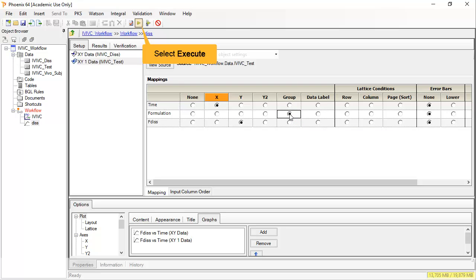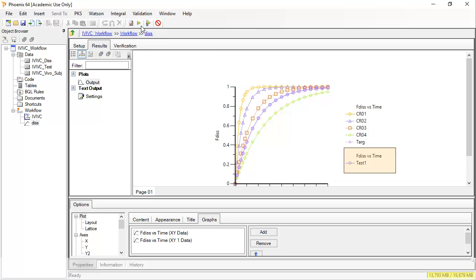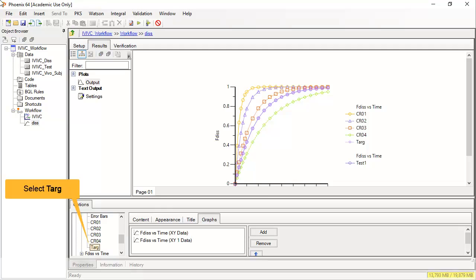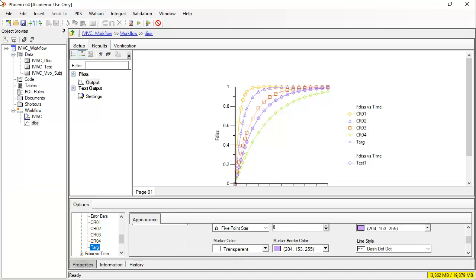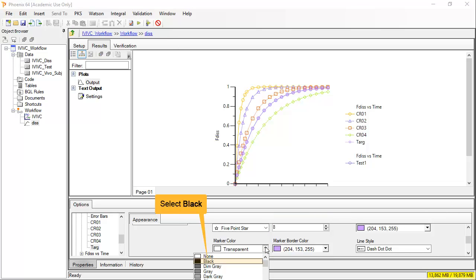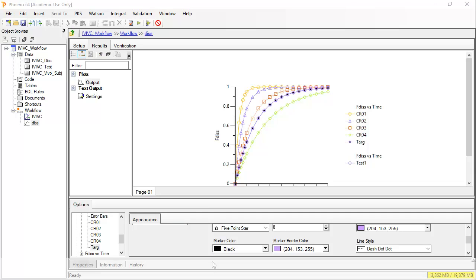I will then map the data the same as the first worksheet. Before re-executing, the new test profile is added to the plot. In this case, the target and test1 are very similar, so I'll just format targ to make it easier to see. By expanding the tree under options, almost all the plot elements can be formatted. We can now see the black stars of the target sit within the markers of test1.